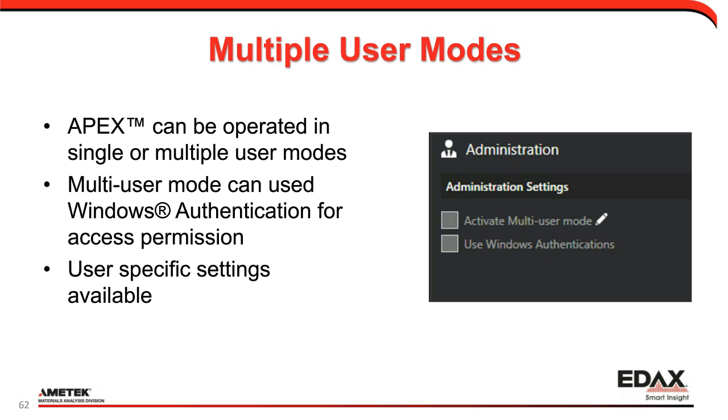And some of those can be the cosmetic things. I want my windows to look like this. I want them to be this color. But some of them are also limiting what functionality is available. With EBSD, we're inserting a detector after the sample is tilted. We're moving stages for combo and batch scan. If you're managing a facility, you might not want to give users permission to do that until they've been fully trained on keeping the detector safe. And so with these multi-user modes, you're able to manage that functionality for different users.